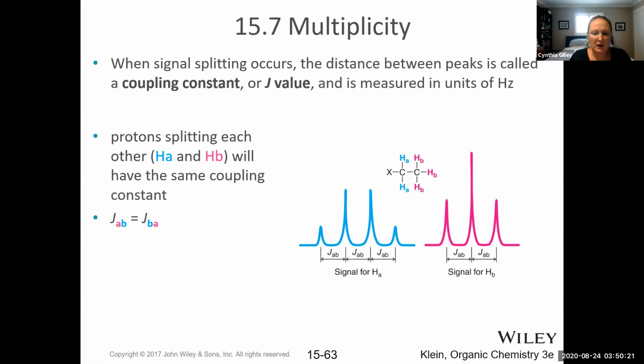The NMR will allow you to do some peak picking, where we can get the exact chemical shift of all of the different peaks in the signal, and then the difference between them. For example, I'm just making up numbers here, 4.00, just to make it easy on myself, and then this one is 4.07.